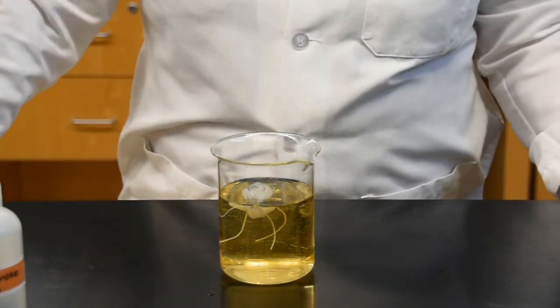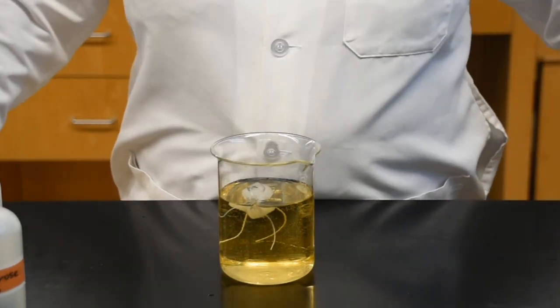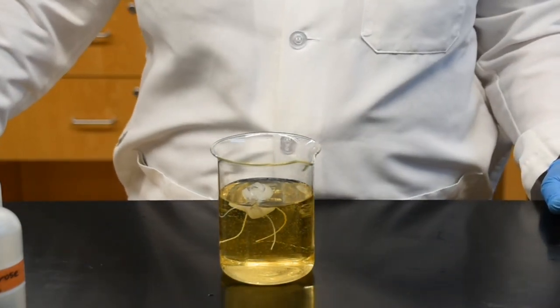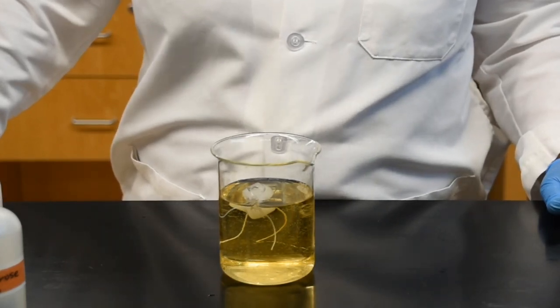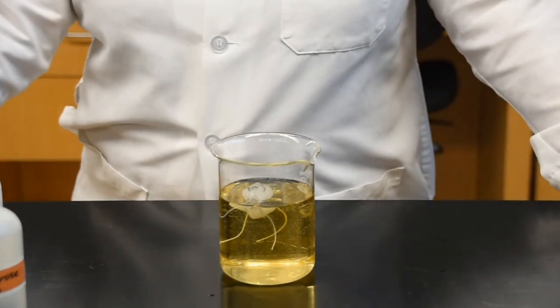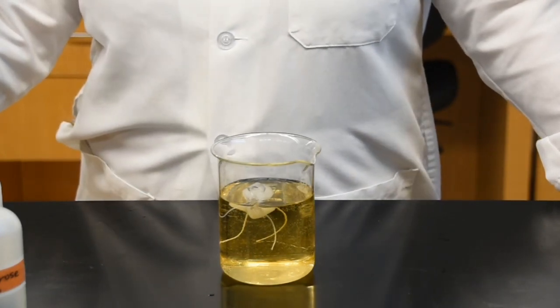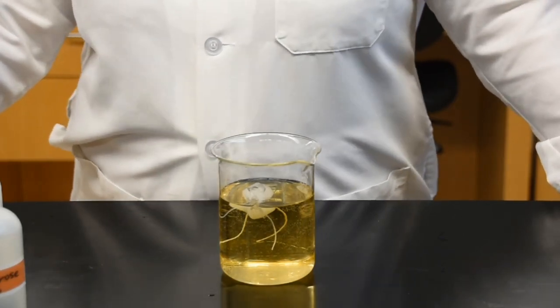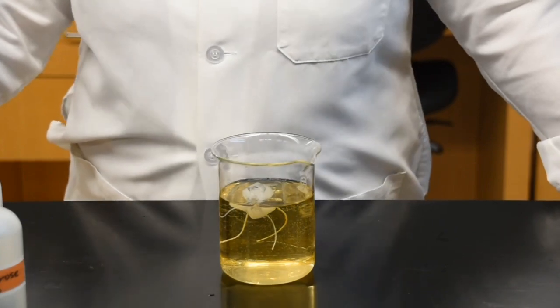Our last prediction, the two options we would have, is if the solution in the beaker, which is currently yellow, stays yellow, that means the starch was not able to get out of your baggie and into the solution. And if the beaker solution, which is currently yellow, changed to bluish black, that means the starch molecule was able to get out, and considering the observed color change, it means the starch interacted with our indicator iodine.